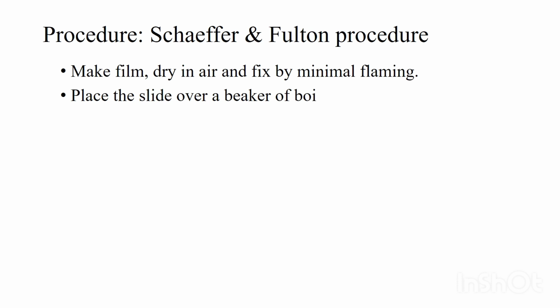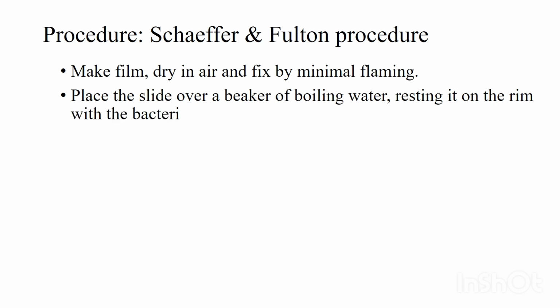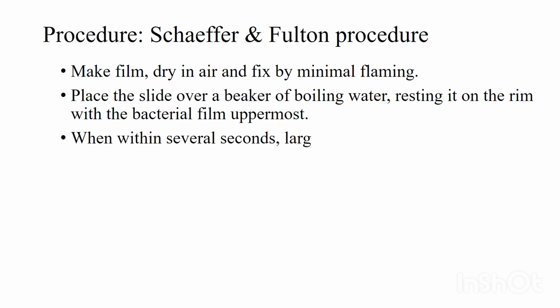So what are the bacteria that produce spores? We can broadly classify bacteria into aerobic spore bearers, anaerobic spore bearers, aerobic non-spore bearers and anaerobic non-spore bearers. An aerobic spore bearing organism example is Bacillus anthracis. Aerobic non-sporulating organism examples are Escherichia coli, Klebsiella pneumoniae, Salmonella and Shigella species. All these are non-sporulating.